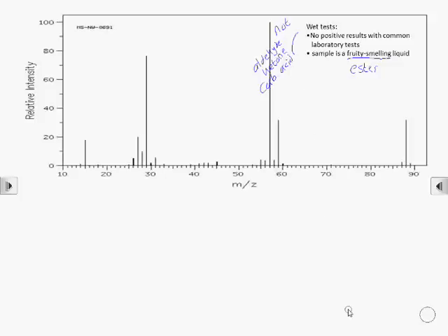We start interpreting the mass spectrum by looking at the peak furthest to the right. This is the molecular ion peak and tells us the relative formula mass of the molecule. Since we think it's an ester, we can look at what the mass for the carbon and two oxygens of the ester group would be. Those add up: 12 plus 16 plus 16 is 44.